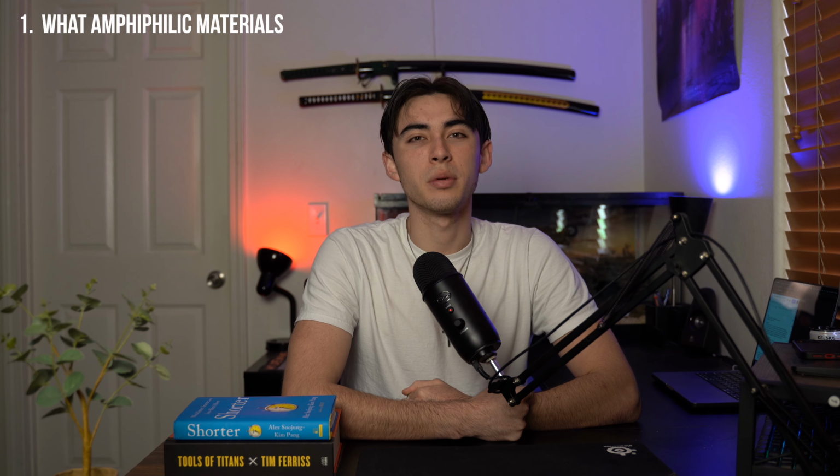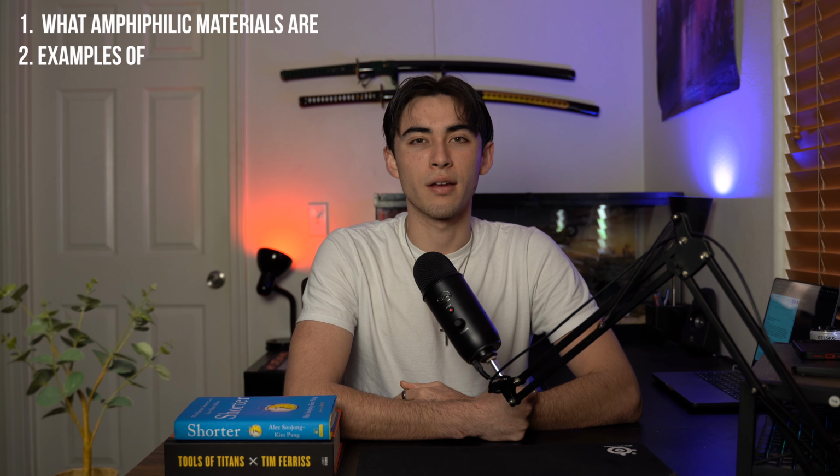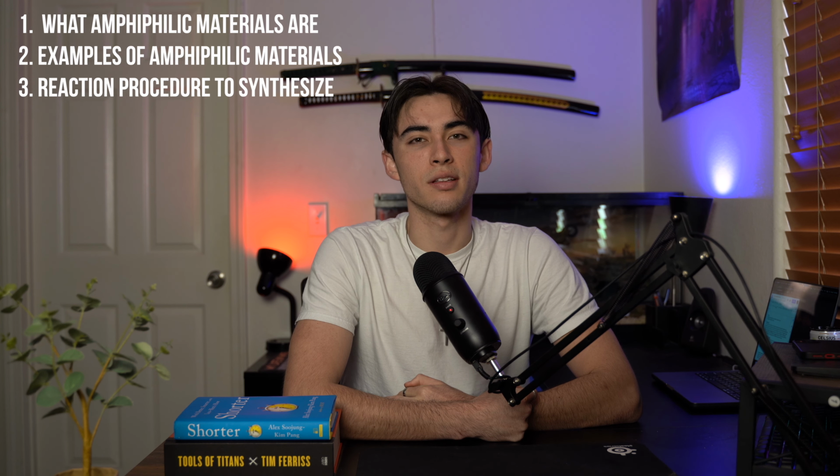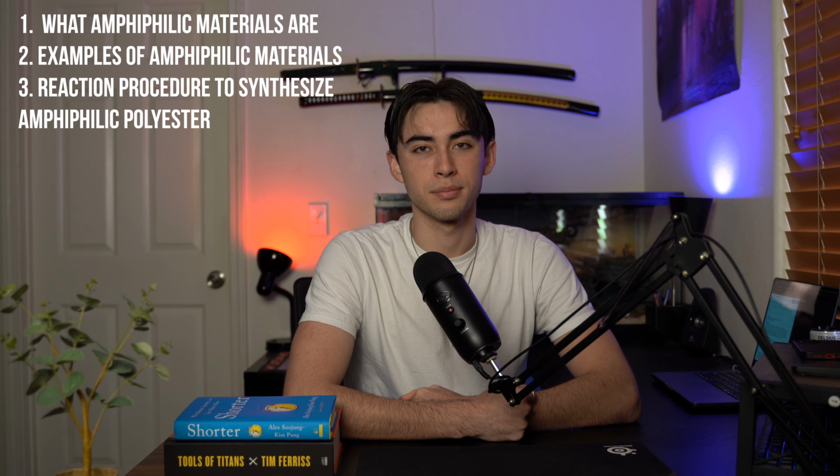In this video, we will be going over exactly what amphiphilic materials are, examples of amphiphilic materials, and a practical reaction procedure to synthesize an amphiphilic polyester. We will then demonstrate its switchable properties by testing its ability to encapsulate red and green dyes.